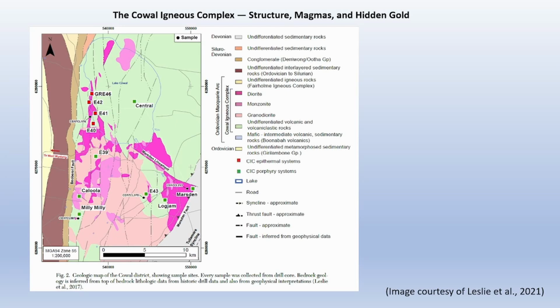And now comes a cutting-edge tool for exploration of this area, which is zircon geochemistry. By using laser ablation ICP-MS and trace element mapping, researchers measured oxidation state, temperature, and water content across individual zircon grains.